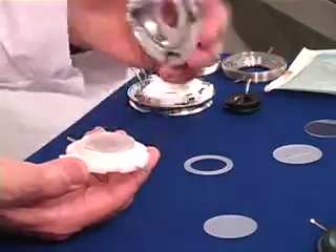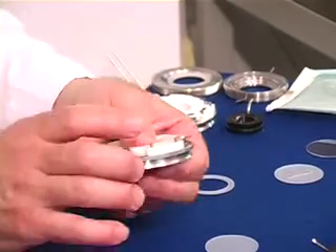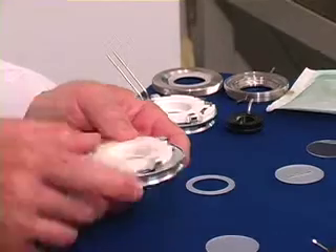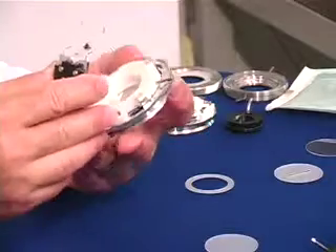Then you apply the heated base. Without the need for tools, you simply rotate the outer knurled ring, and it will symmetrically lock down the microaqueduct slide, gaskets, and cover slip. Now you have the cover slip on the bottom surface and the microaqueduct slide on the top surface, so this is ready to go on an inverted microscope after you apply the electrical connector.